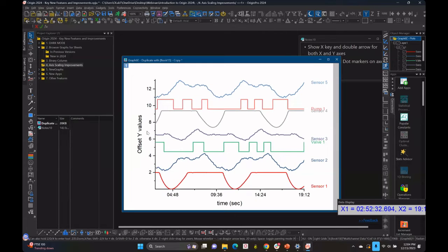So please play with that. We hope this feature is useful for you when you're adjusting the axes to precise values, or you're exploring large time domain data and you want to quickly zoom and pan. Okay. Questions, comments on that?